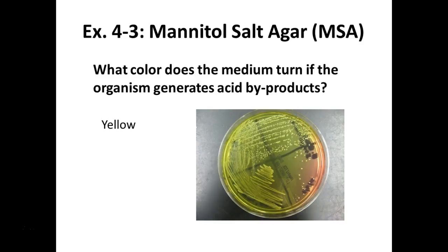It was tucked away in my refrigerator. Shh, don't tell anybody. I had one plate left. So it's taped shut. It really is Staph aureus. But most of us have this in our nose, y'all.